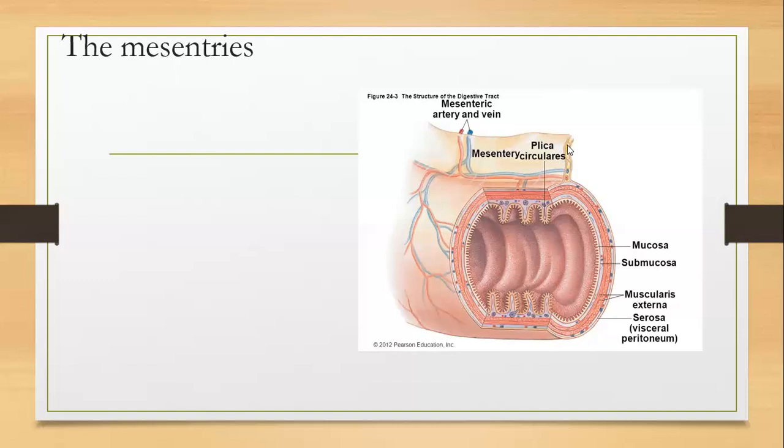Now, what I wanted you to take note of is the arrangement towards the lumen. You can see the mucosal layer, how it has high infolds. These are called the circular folds or plicae circulares. Like I told you, this is in a foreign language, which I don't care so much for. All you need to remember is that these are circular folds. And what you need to take note of is that these circular folds are permanent. So they are not going to stretch out. They are permanent circular folds.